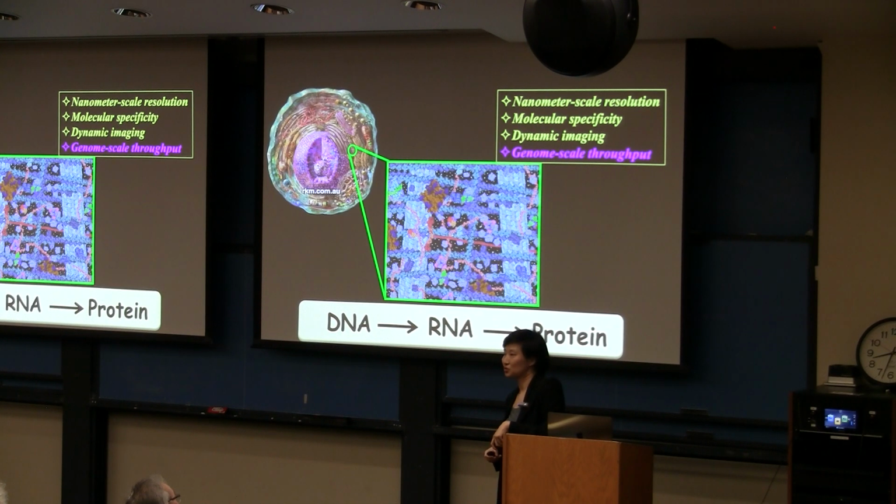And the problem is we do not have thousands or more distinguishable colors. That is a very well-known physical property, and that is because these fluorescent molecules that we study, they have finite spectral width. And these finite spectral widths make it only possible to distinguish a handful of different kinds of colors in the visible wavelength range.